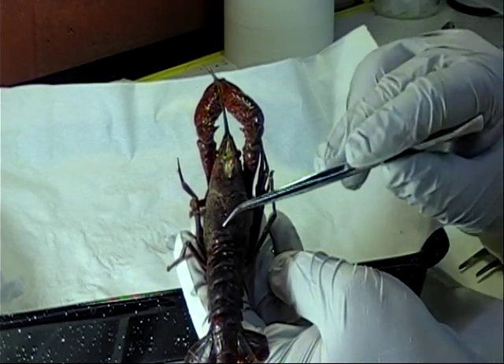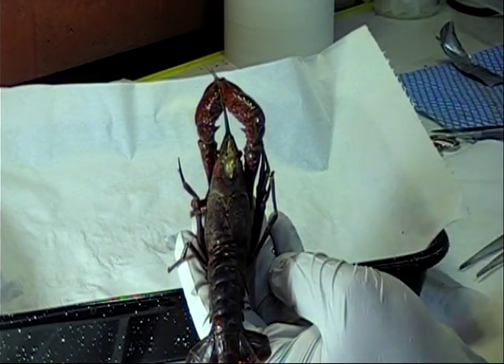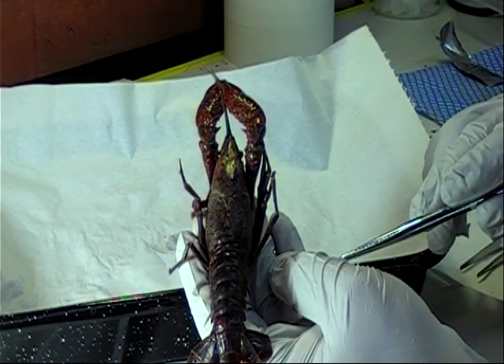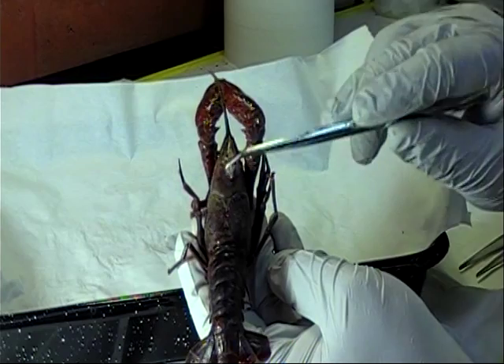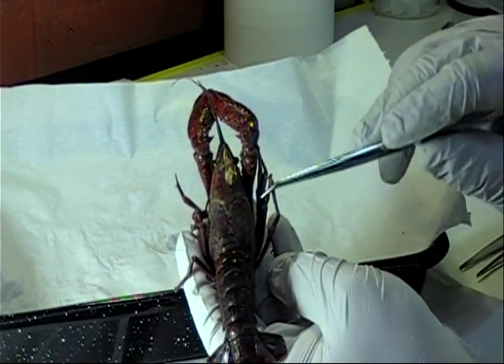The cephalothorax is divided into 13 segments, and the abdomen is divided into 6 segments. Each segment contains a pair of appendages. The body of the crayfish is covered by a carapace, which is made of chitin, a similar material to your fingernails.